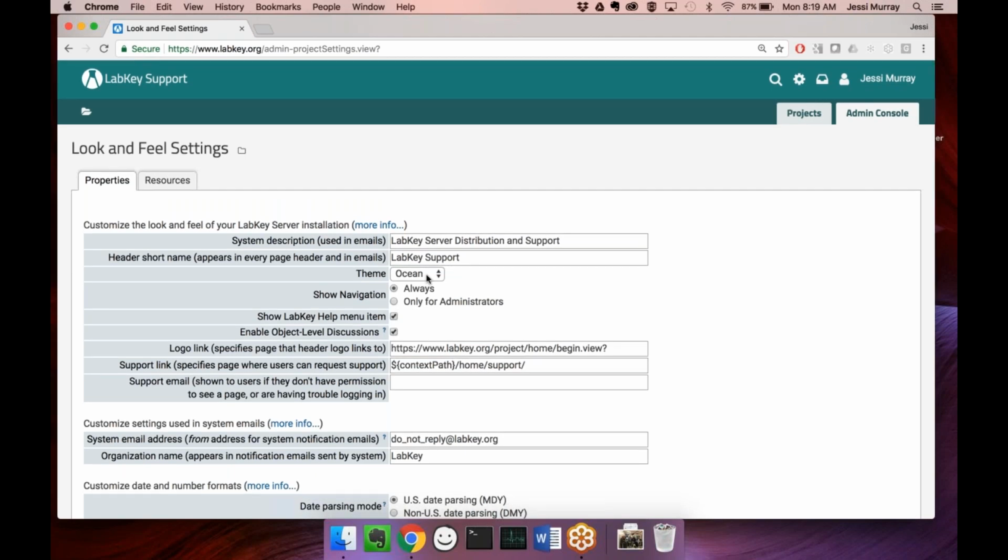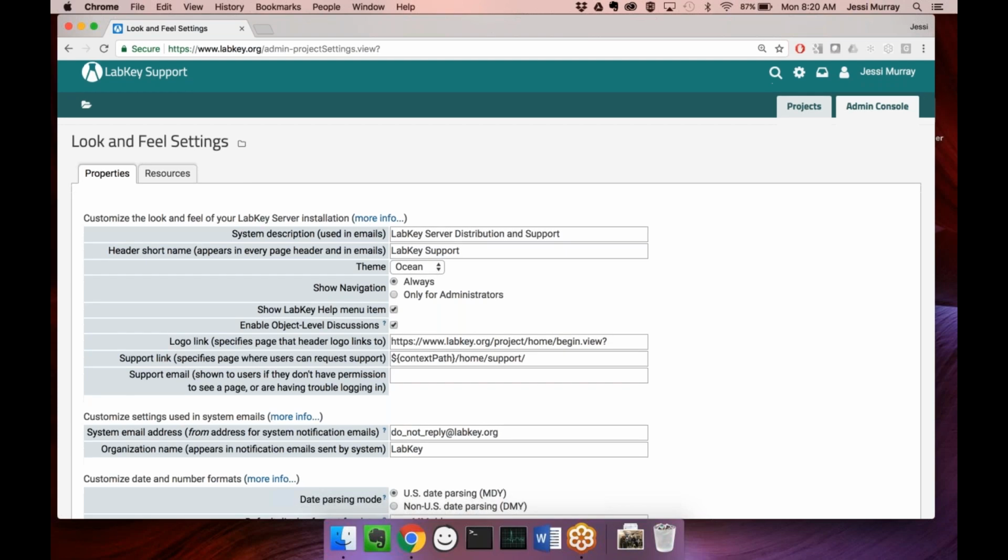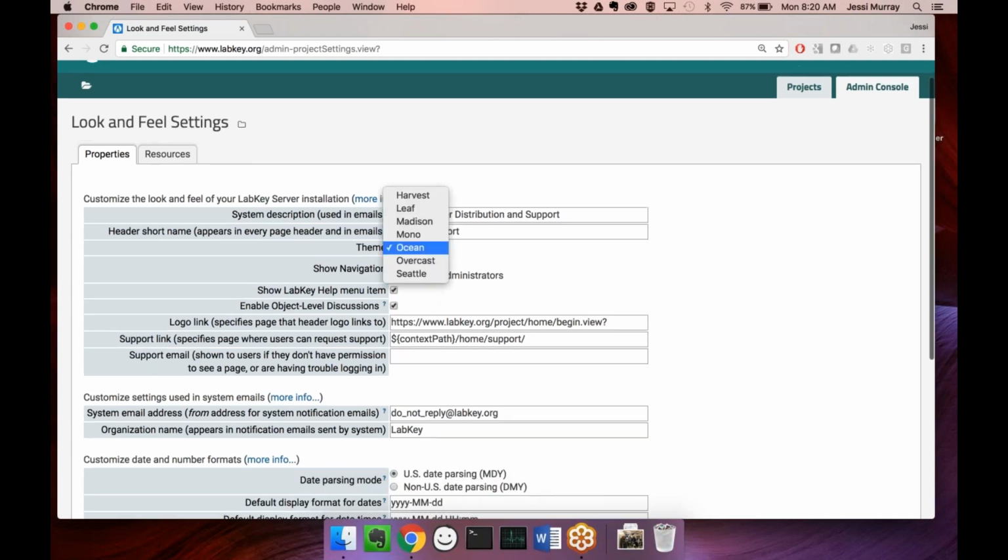You may be asking, what's going to happen to my custom CSS? The unfortunate answer is that you're going to have to probably redo a good amount of that. But we're hoping that with the increased cleanup work that we did within our CSS, it should be a lot easier for you to set the variables that you want the way you want it.